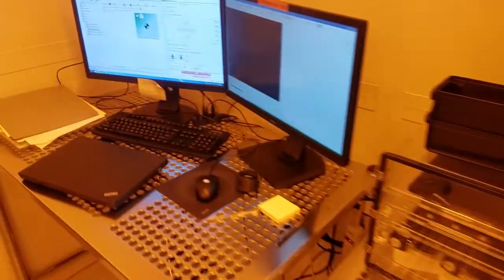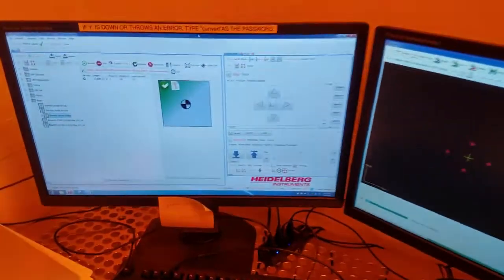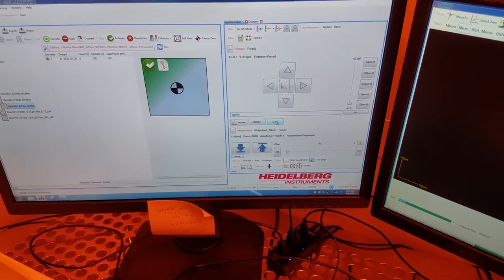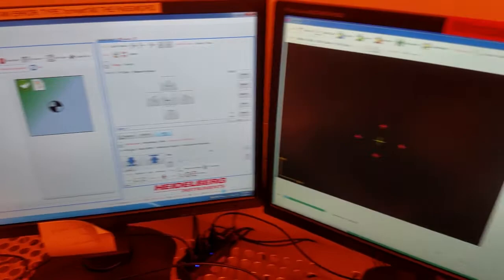The first step in running the tool will be to load our sample. Go to the software on the tool and in the system control tab click the load button to drive the stage to the load position.